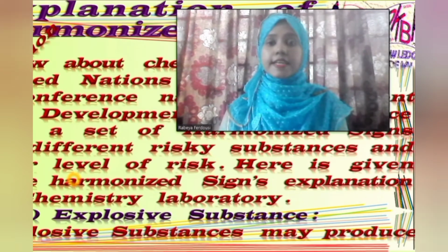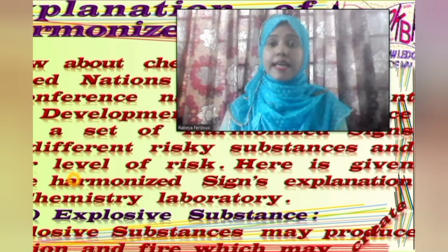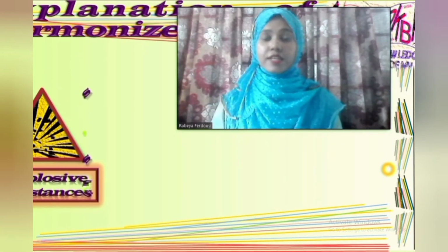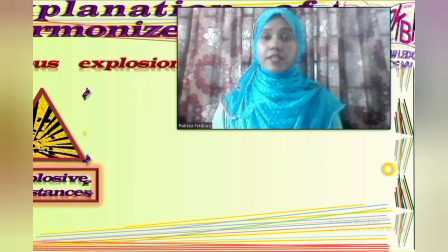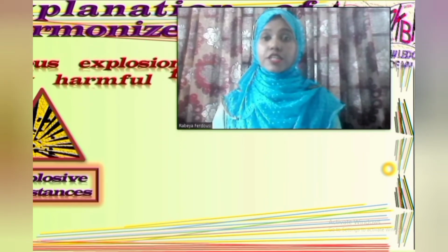Explosive substances may produce friction and fire which can again create a serious explosion. Being the reason of serious explosion, these types of substances are very much harmful for human body as well as for our laboratory too.